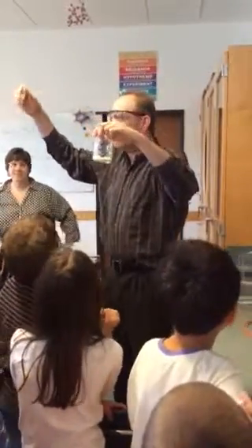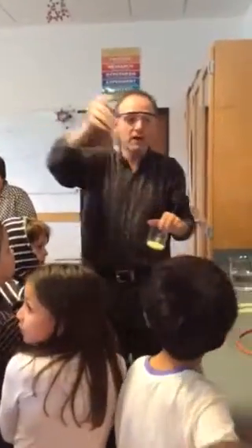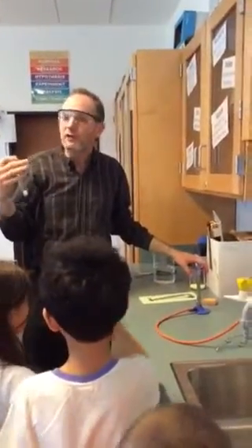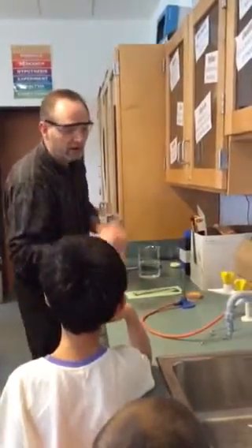Okay, I am going to heat up this solid yellow element, and it's much like the solid element I heated up over there. While I'm doing this, I want you to think to yourself, does this sulfur act the same way as the iodine, or does it act differently?